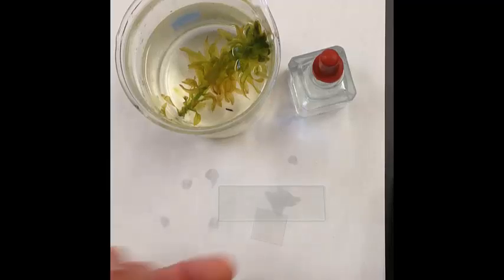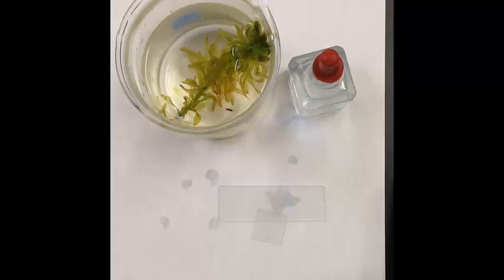Hi there boys and girls. What we're going to do today in this video is learn how to make a wet mount slide. A wet mount slide is just another way to prepare a specimen for viewing under the microscope.